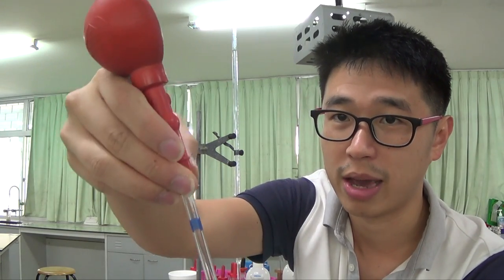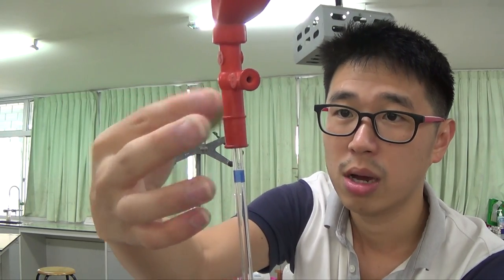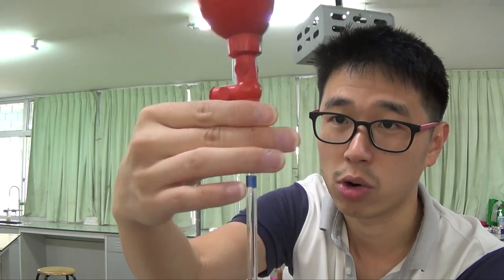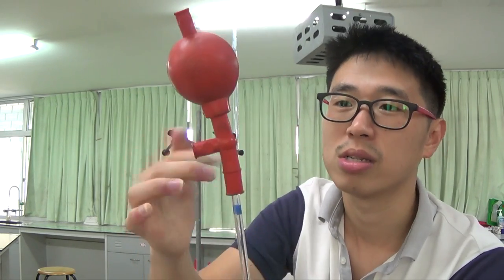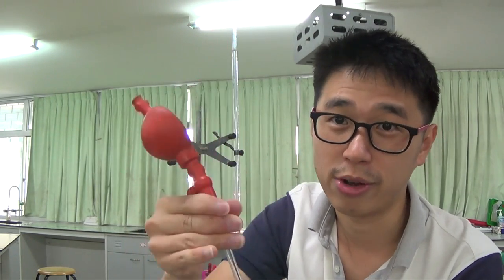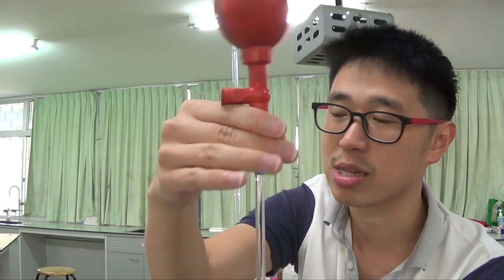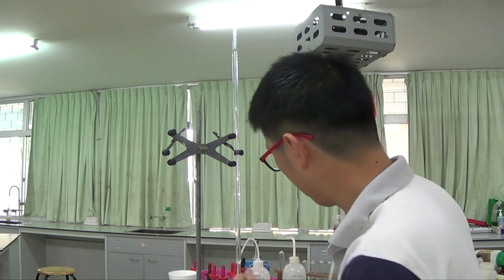This is the pointy end, so we push this in, but be careful, you do not want to push them in straight away. It's rubber on glass, so put it in and make sure it's tight by rotating it. You rotate it, you don't push it in, because if the glass breaks, it can pass through the rubber and injure you. So after I rotate it, now it's tight, it's snug.